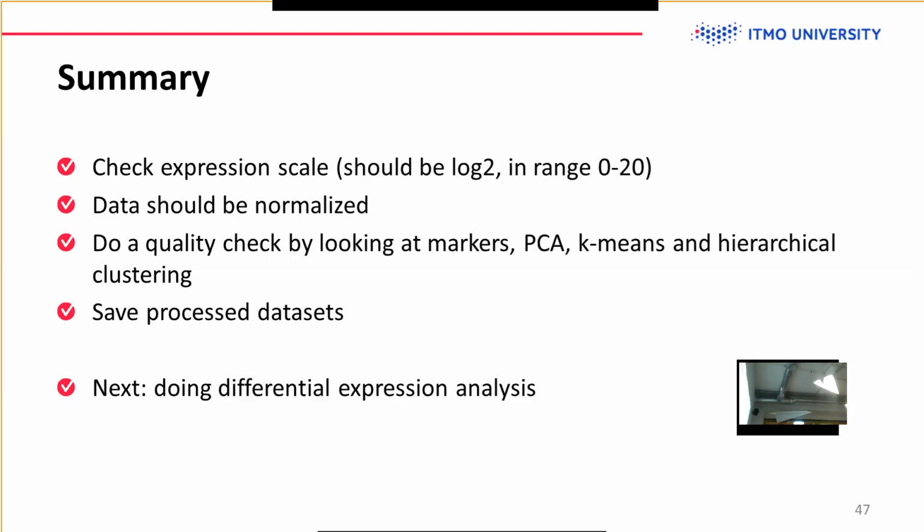So this is the thing that you want to look at in your dataset. In practice, I guess you always should look at it, because even if this analysis was done multiple times in your laboratory, it's biology, so everything can work randomly at some point.